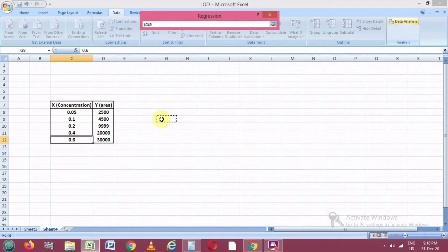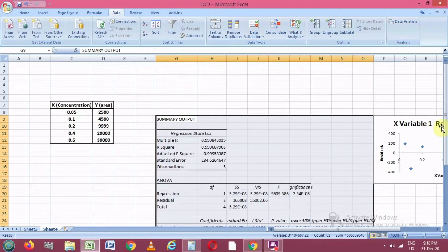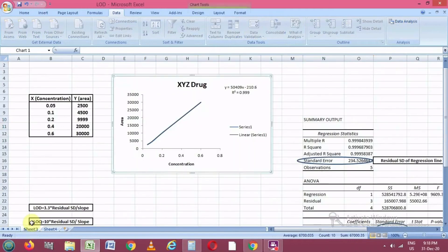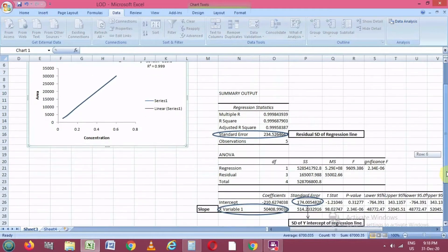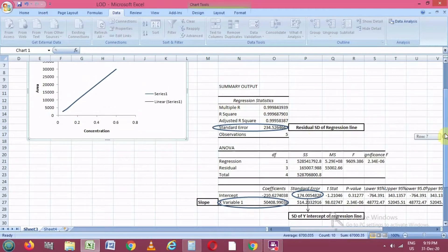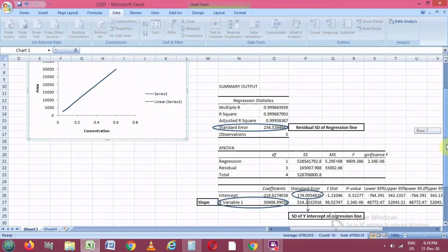The Data Analysis tool will give you all the regression and statistics values you need. After selecting Regression, you first select the Y values, then select the X values which are the concentrations. Then tick the options for residuals, standard residuals, and residual plot. For the output range, select the cell from which you want the results to start, then click OK.